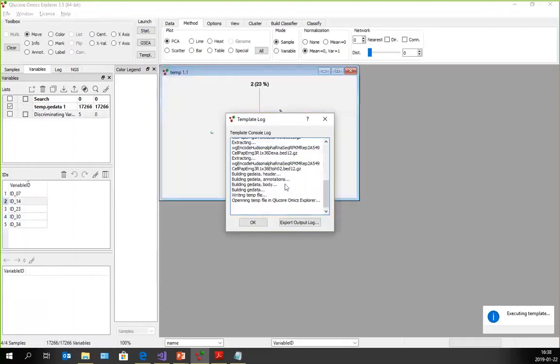And here we see another thing that is rather useful, because when you want to do debugging of a template, one of the things you can do from a Python script is to print things to the console window. However, when we are executing, there is no console window. But we do save that information. So if you print something in a template, that printed information actually is saved and displayed after the template has executed.